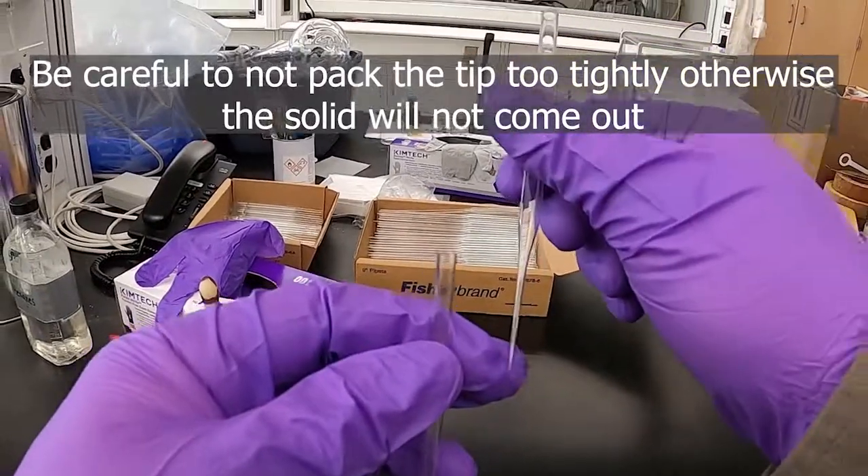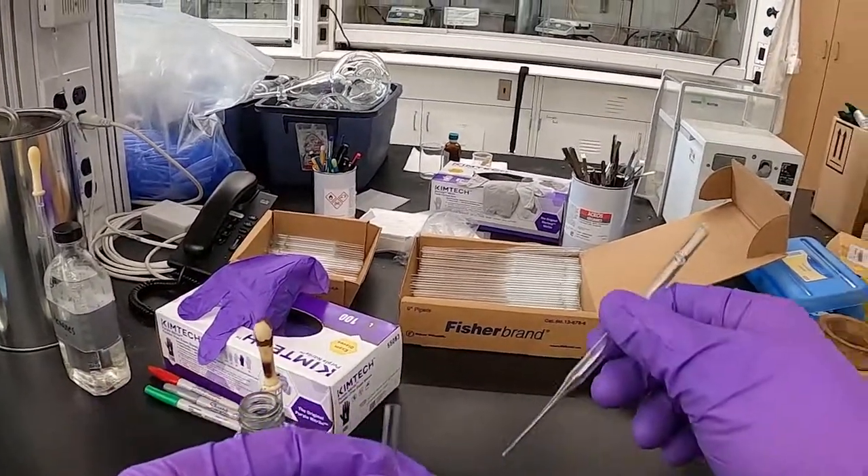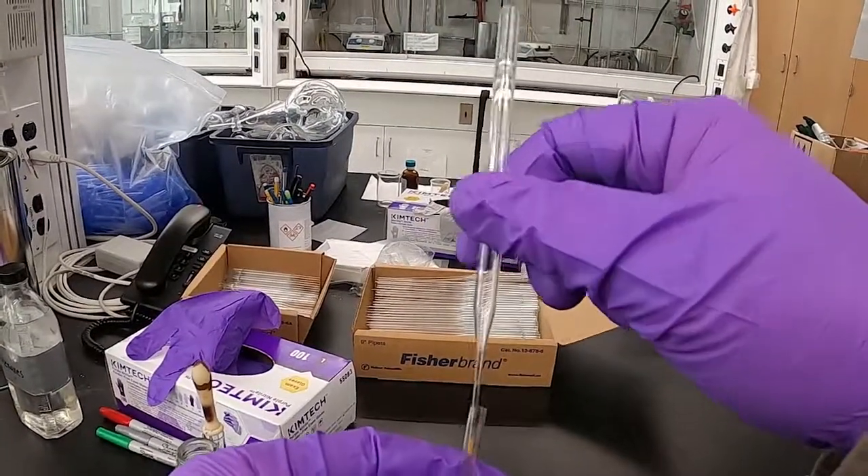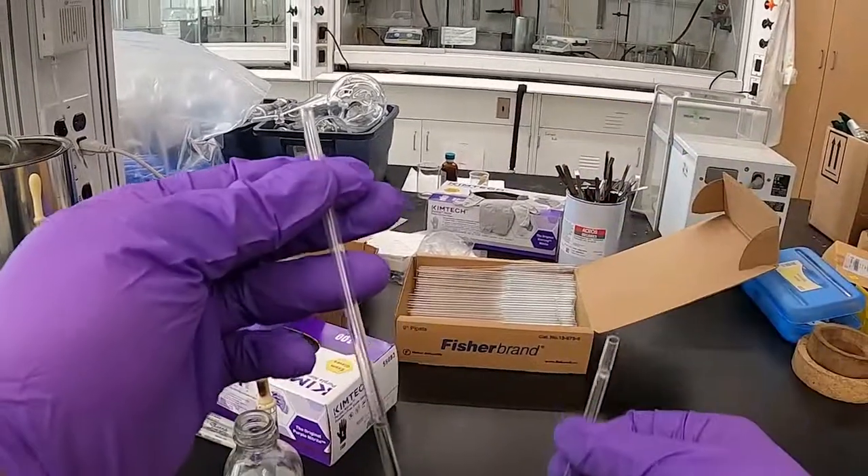If it packs in there too tight it won't come back out. Then you can just repeat that process — lightly packing some up into the tip and shaking it into your NMR tube.